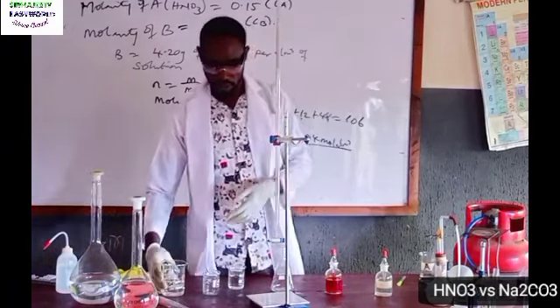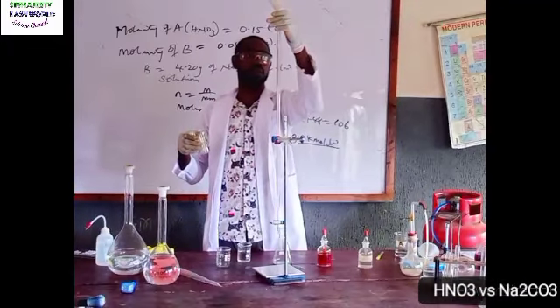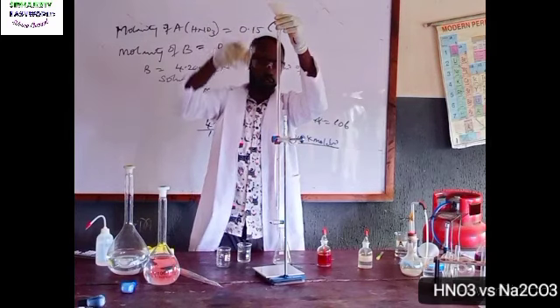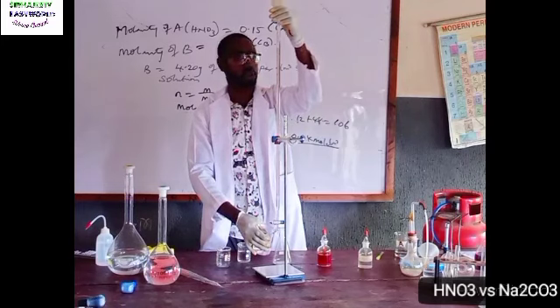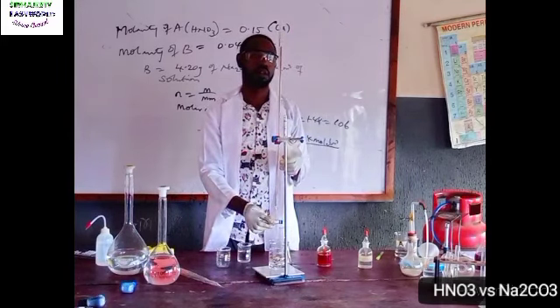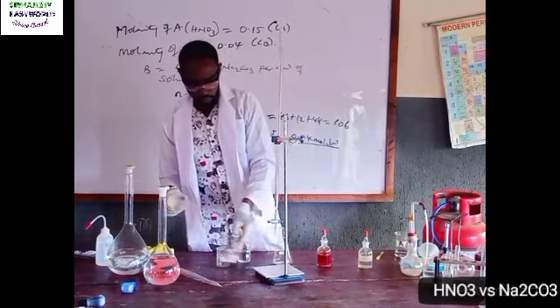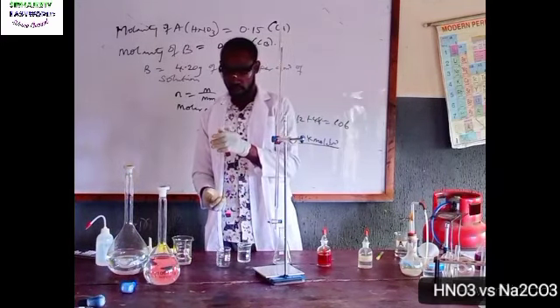Then repeat again. This time around I'm filling the one I will use. Then the same thing, you also wash the pipette with the base.